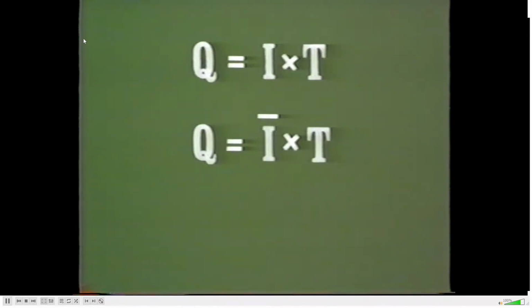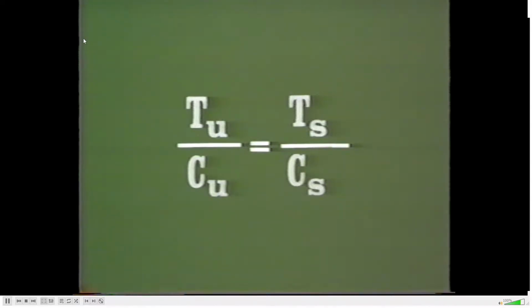Since the current is kept constant at the generator electrodes, the elapsed time of titration is proportional to the number of coulombs generated. The time necessary to reach the endpoint is taken as a relative measure of the chloride concentration in a given sample. Let us compare the concentration of a known standard and an unknown by establishing a simple ratio and proportion of each with the respective times of titration. The titration time of an unknown is to its concentration as the titration time of a standard is to its known concentration. The ratio established should tell us the concentration of chloride in the unknown.